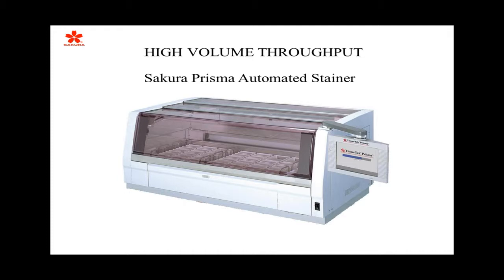Now, what does that mean? That means if you only have a trickle of water on your rinse steps, then you probably have to rinse longer to make sure that the reagent or the dye that you were using has been rinsed out, such as hematoxylin. If you have a much greater flush or flow of water, such as this, then you can actually shorten your rinse cycles, maybe down to just a minute, and still have optimal rinsing.